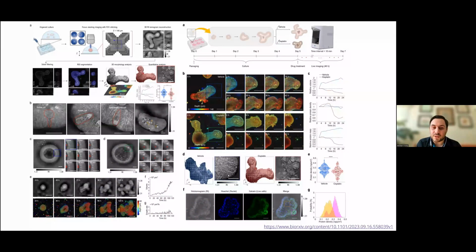And an extension to that was, what type of quantitative information can we get from imaging organoids? Okay, I think that is also a good question. This is the very beginning of the study. We have subcellular imaging capability of live organoids without clearing, without sectioning, and without staining.